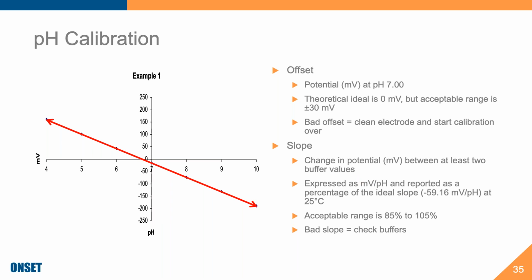So if you have a bad slope, I forgot to mention this, it's important to check the buffers that you have and try calibrating again.